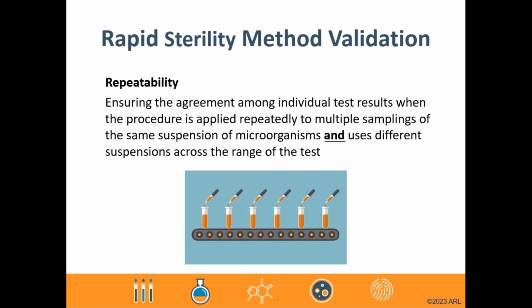Repeatability is defined as the degree of agreement among individual test results when the procedure is applied repeatedly to multiple samplings of the same suspension of microorganisms. This is done primarily to ensure that the results are both consistent and repeatable.